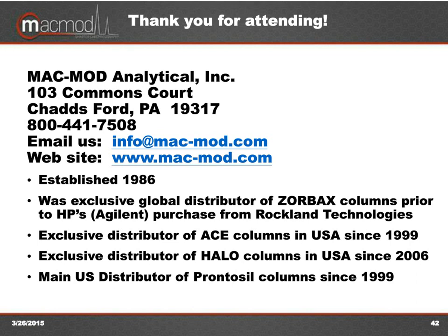Thank you, Tom. And we have time for one final question today. Is there a guide, flowchart, or program that can calculate the best type of column and eluents with MS modifiers based on the analyte, chemical properties, and matrix for LC-MS? What is the precision of this type of software?